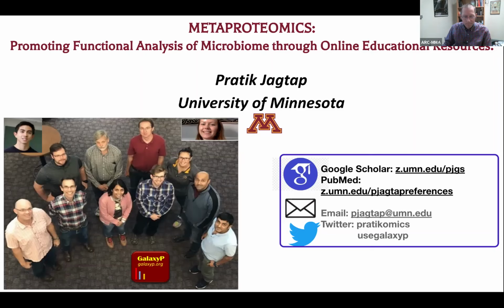So today's talk, I'm going to be talking more about the data that comes out of the instrument and how we can analyze it to get more information than just looking at single organism proteomics. That is usually what mass spectrometry is used for. So the area of research I'm going to talk about today is metaproteomics. And I'll try to go through the slides and explain to you how we have implemented some analytical workflows into a Galaxy platform and how we are disseminating this through various educational resources that are available.